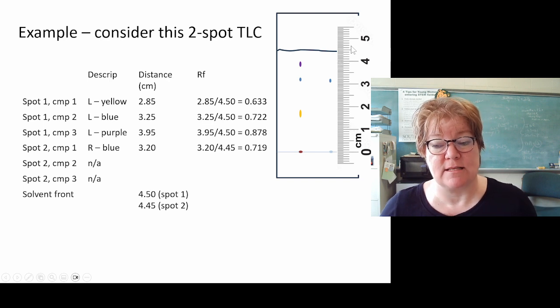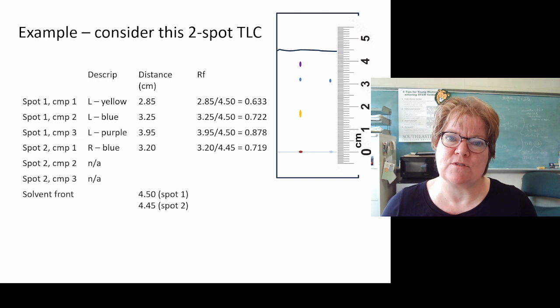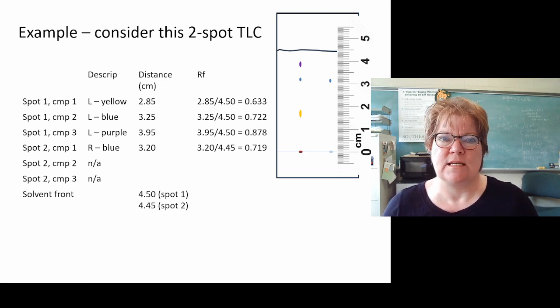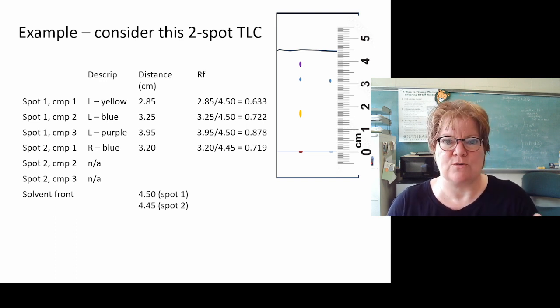You should have already done this in lab, but if you find that there's an issue, note that, because you kept your TLCs in your lab notebooks, each partner has one of them. If you realize there's an issue, you just have to get a nice ruler and redo things.